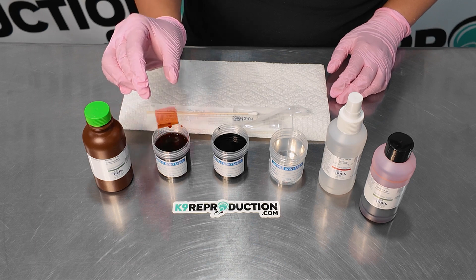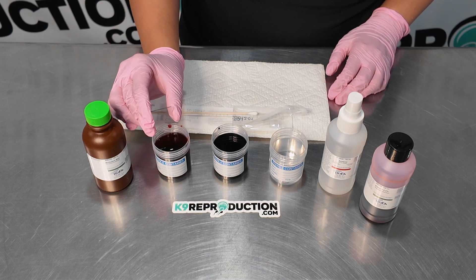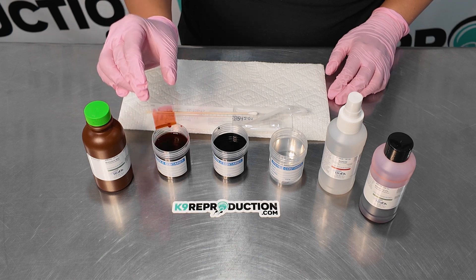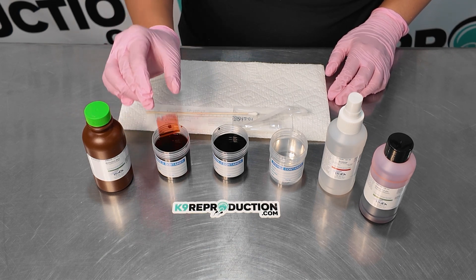Now that our slide is set, let's move on to staining. First, take the slide and gently dunk it into the first solution, Eosin Y — the red solution — for about 15 dunks or 15 seconds.